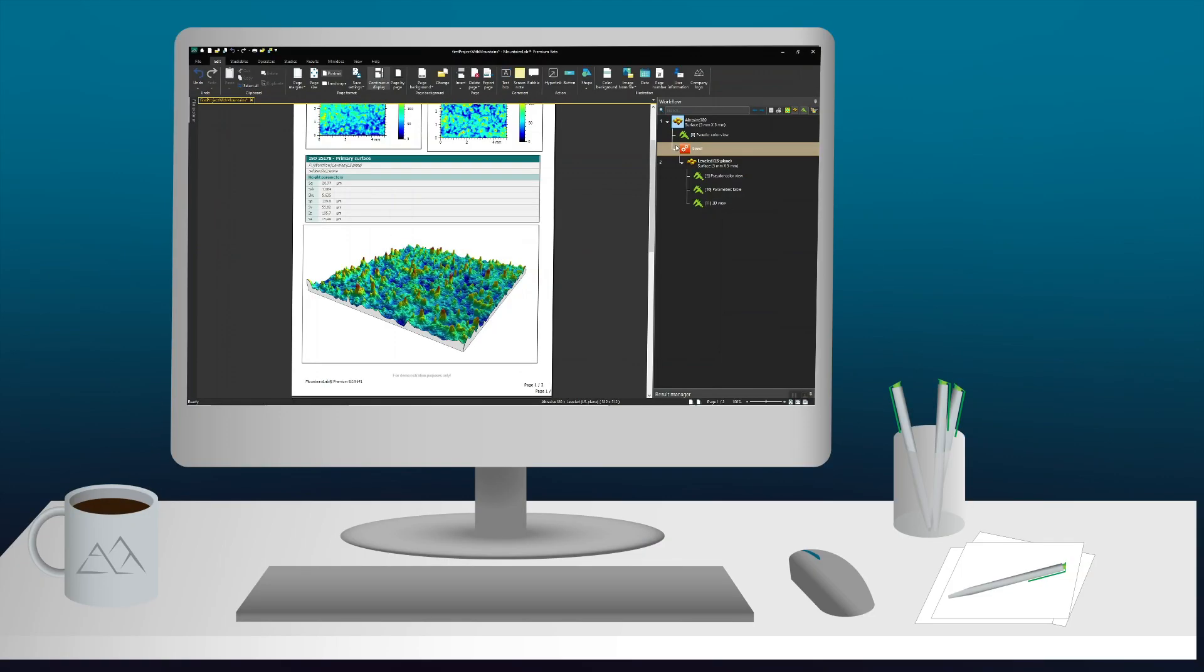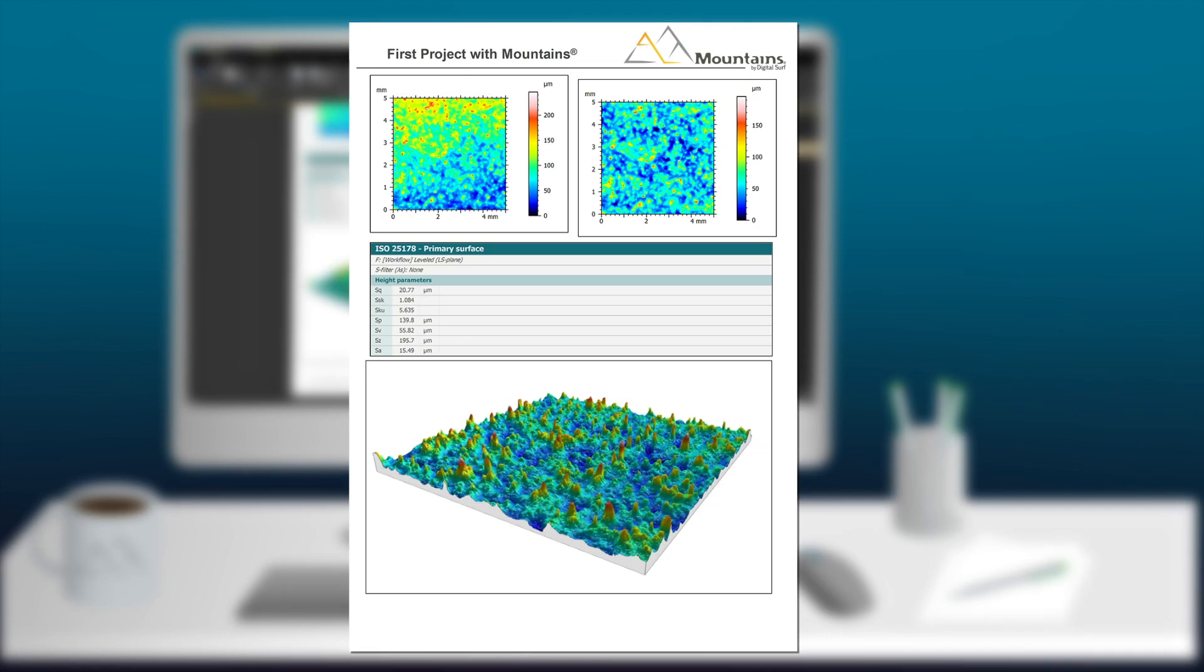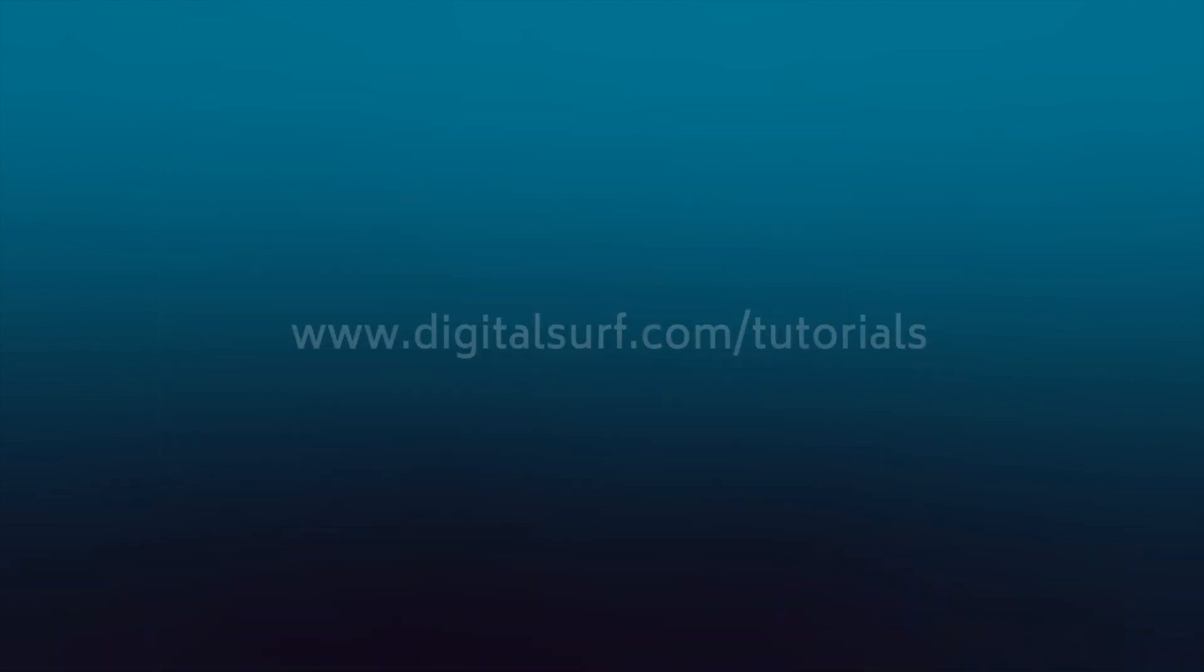And there you have it. I just created my first analysis project using MOUNTAINS. If you'd like to learn more, check out the next tutorial in this series.